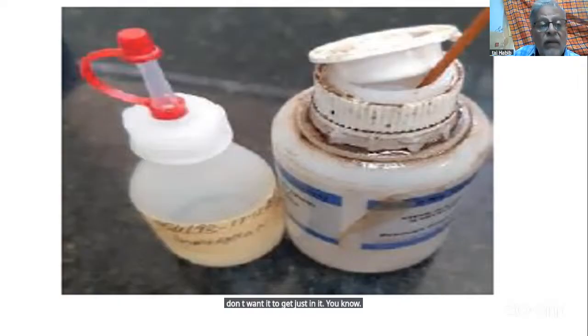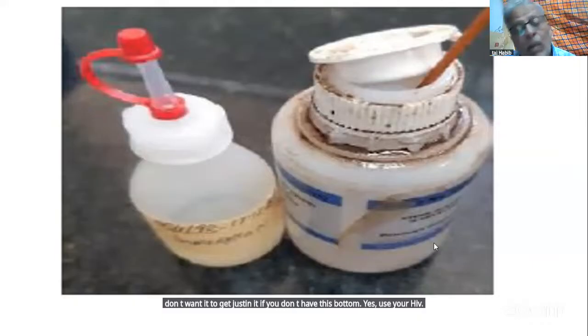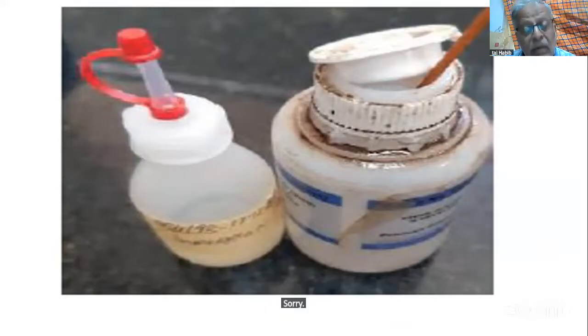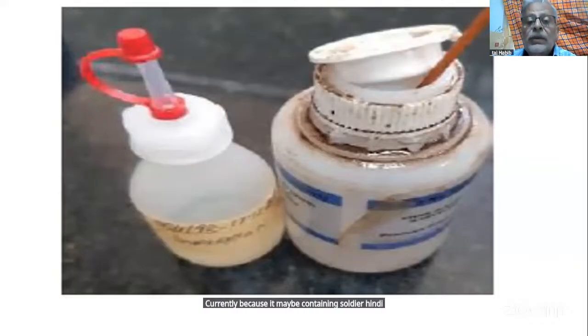If you don't have this bottle, just use your HIV dropper bottle, which comes with the buffer. Everybody has got that. Just clean it, wash it thoroughly, because it may be containing sodium chloride. Wash it with distilled water, dry it, and use it.